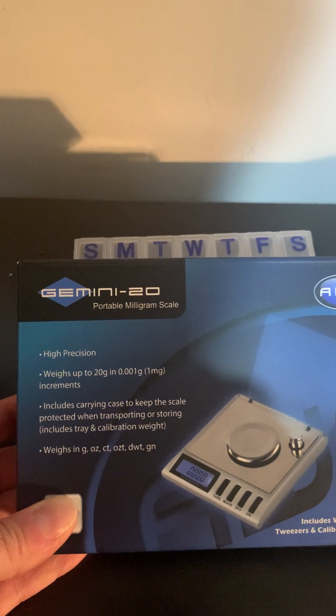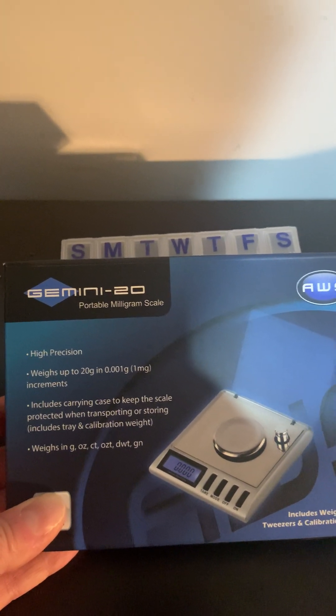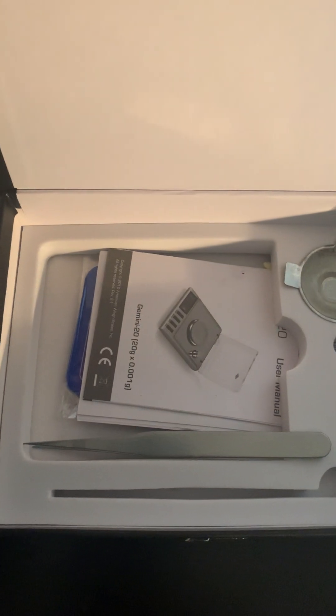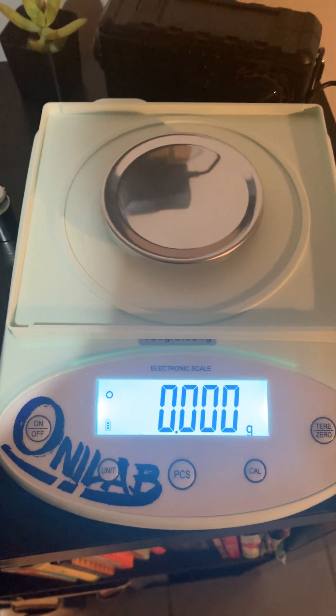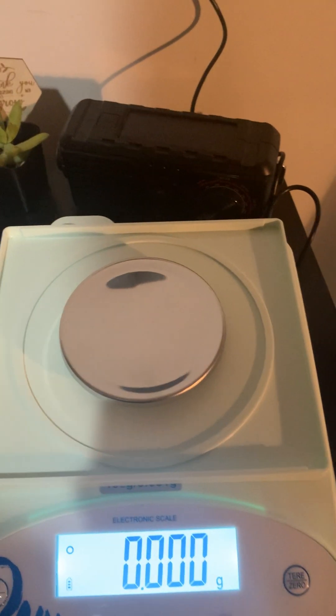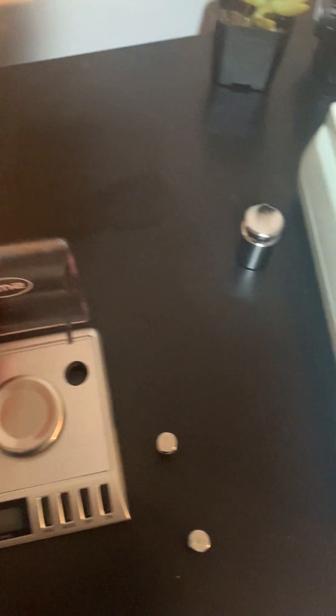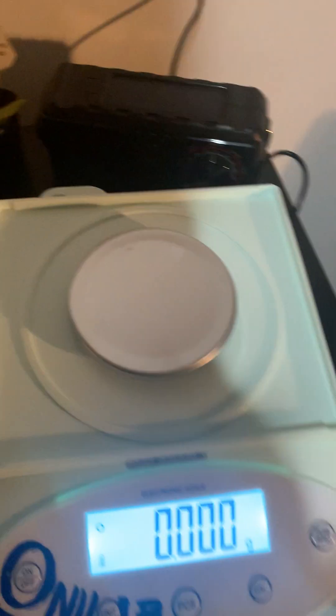The Gemini 20 includes a carrying case to keep the scale protected during transport and storage. It has a number of different weight types, comes with a cool little dish if you're measuring powder, and also comes with nice tweezers, which I've been using to move the pill back and forth on the scale. The Onilab didn't come with the dish or tweezers, but it did come with a big glass case to shield it from wind — you can do the same thing with the Gemini by just putting the cover on top.